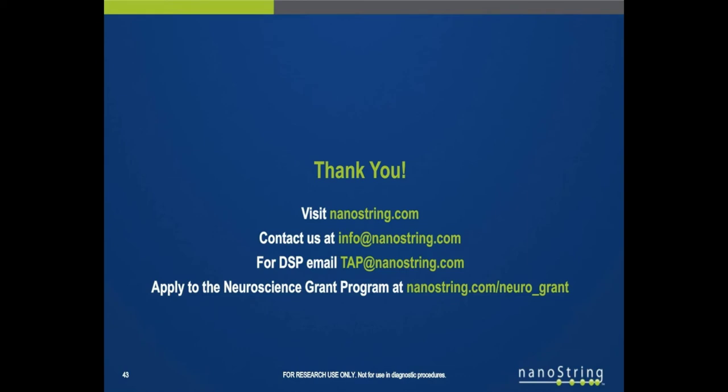Okay. And another question, kind of related, how does the NanoString assay perform on CSF as a sample type? So CSF definitely works on this platform. We have a publication on our website profiling microRNA in CSF. It worked great. We haven't run it specifically on the neuro panel, but again, in terms of input for CSF, that's something that you would want to optimize on a project by project basis.